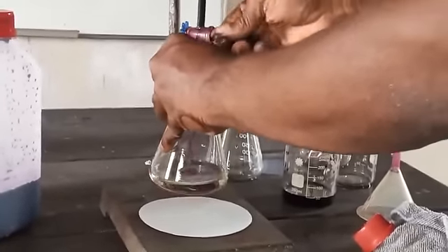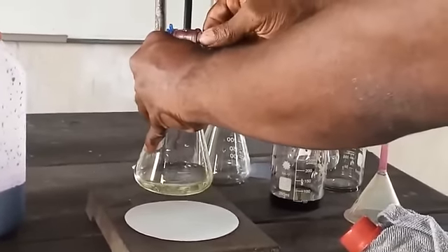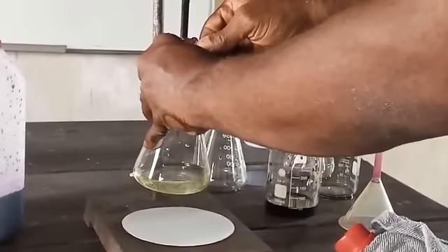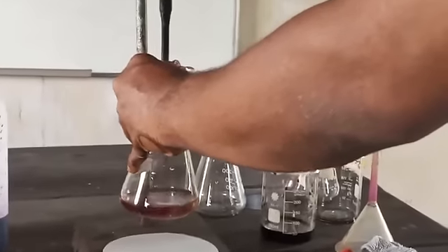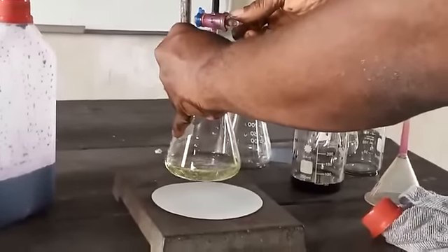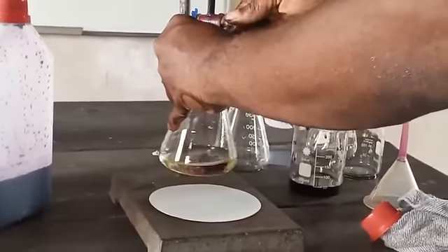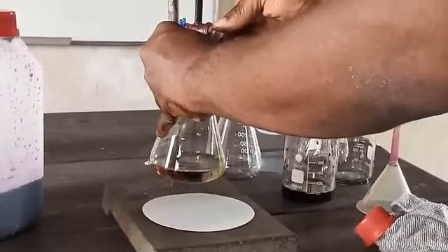That's the next 3.33, which will be around 6.7. So it'll be faster in this case. But we'll not reach 6.7. We'll reach 6. We'll take it drop by drop. So we look at it, we are around 5 point something now. So let's see what's going to happen. Maintain consistency and accuracy. Readings should be very close to each other.